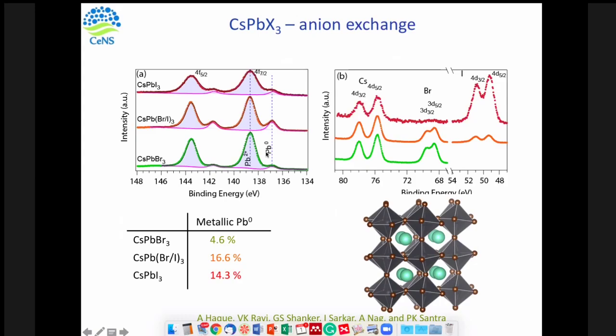For example, this analysis is nothing but analyzing the intensity ratio with respect to the photon energy, at different photon energy. And people use XPS data to quantify different elements, correct? Now, if you use, say, one core level at 700 eV and another core level at 70 eV, these are way far apart. The photon source is identical, but the detector is detecting at two different kinetic energy regions, so they will have different transmission functions. So that is going to matter. It is always good to choose the peaks which are near to each other. The binding energy should be very similar.